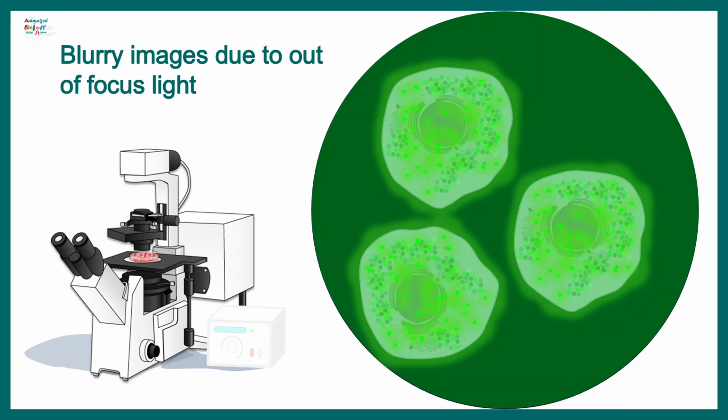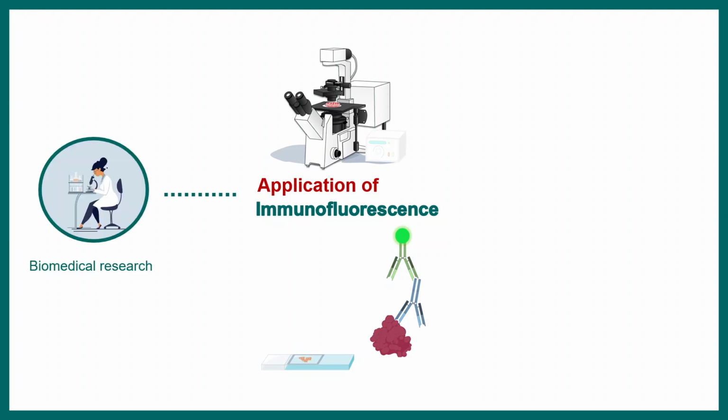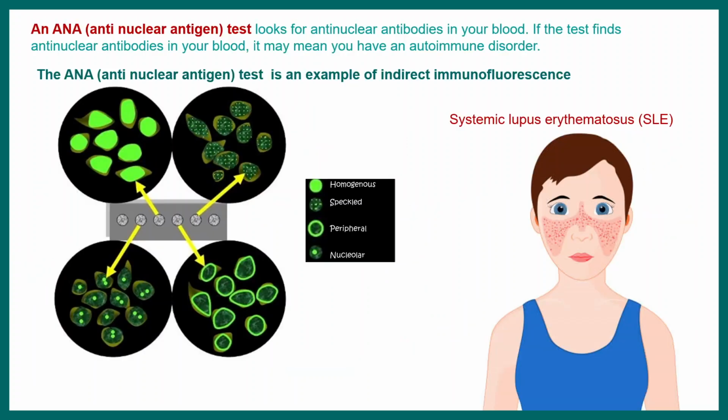And this problem is taken care of in confocal microscopy. Okay, anyway, let's look at the application of immunofluorescence in clinical application. Like we have already looked at the biomedical research part, we can also look at the clinical application. So for several diagnostic tests, these fluorescence microscopy based techniques can be used.